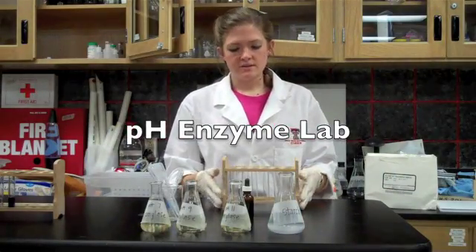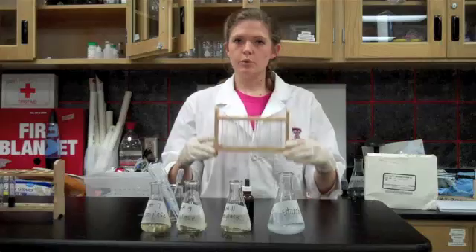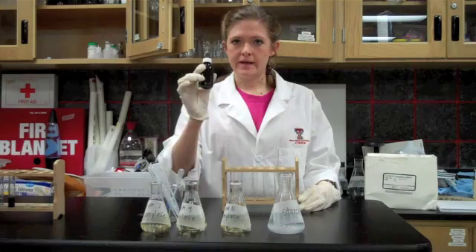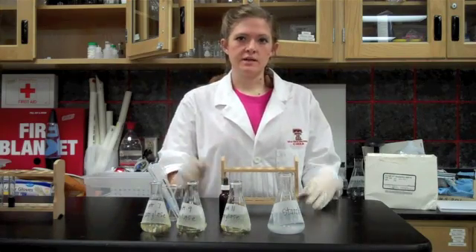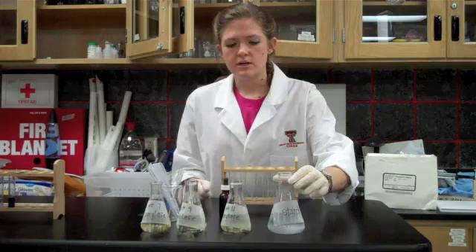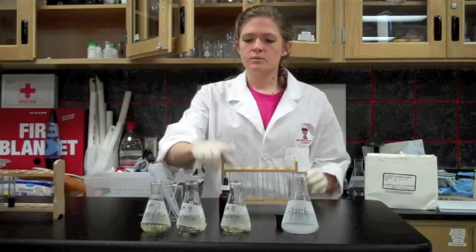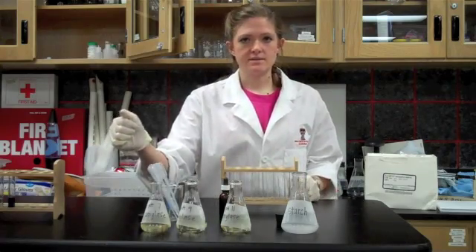The materials that you need for this lab are a test tube rack with six test tubes. You need iodine, and because we're using iodine you need rubber gloves. You need starch solution and three different amylase solutions.